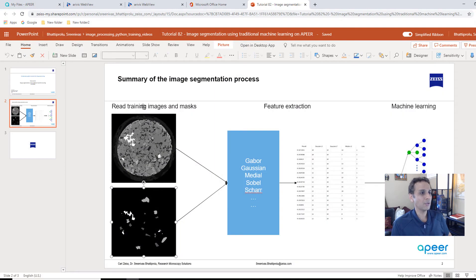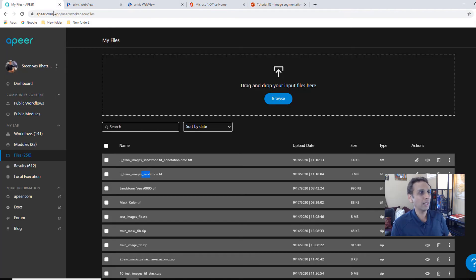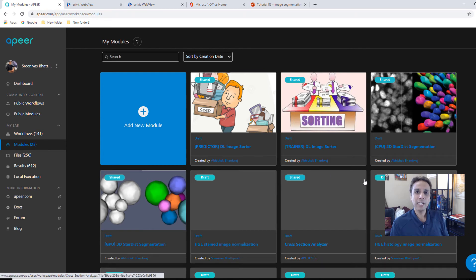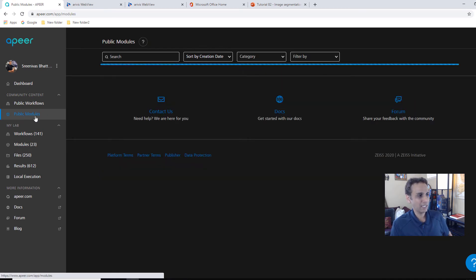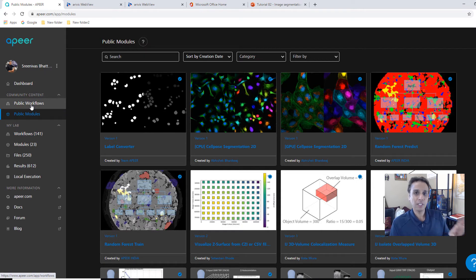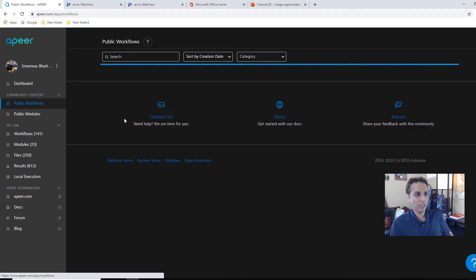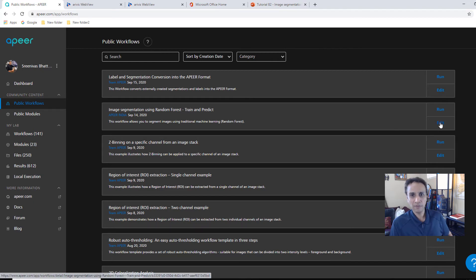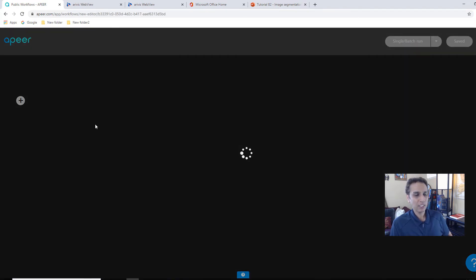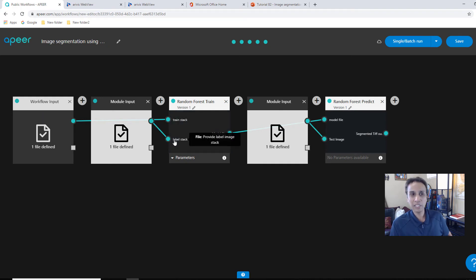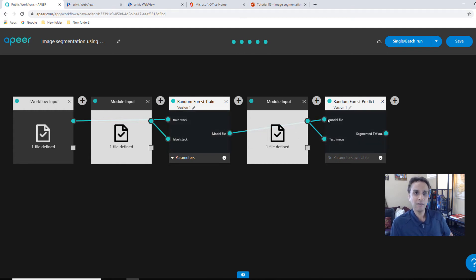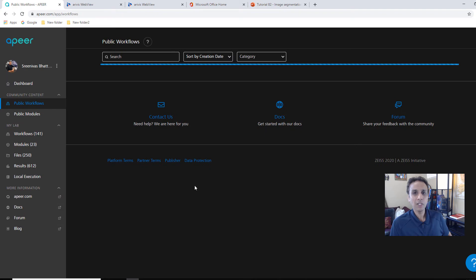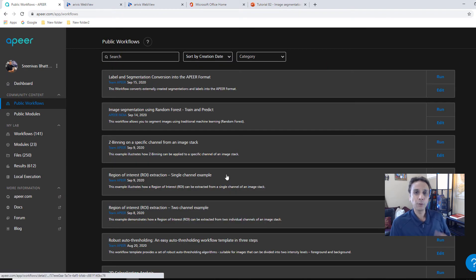The mask should be small in size anyway, so it should not be that big of a process. And typically the mask file name is same as your image file name, the full file name with an extension underscore annotation dot ome dot tiff. Why ome dot tiff? Because with ome dot tiff, you can handle 5D datasets. With tiff, you can only go up to 3D datasets. So we chose to work with ome tiffs. So let's go back to our APEER right here and go to modules. And now let's create a new workflow. Go to public modules, actually.